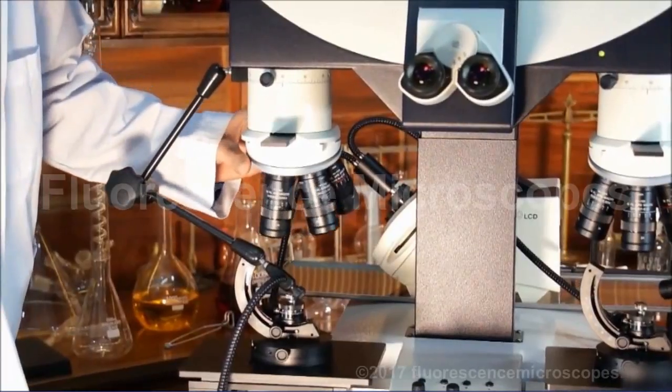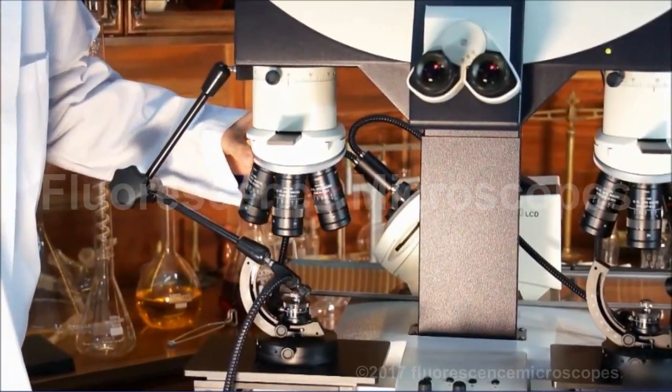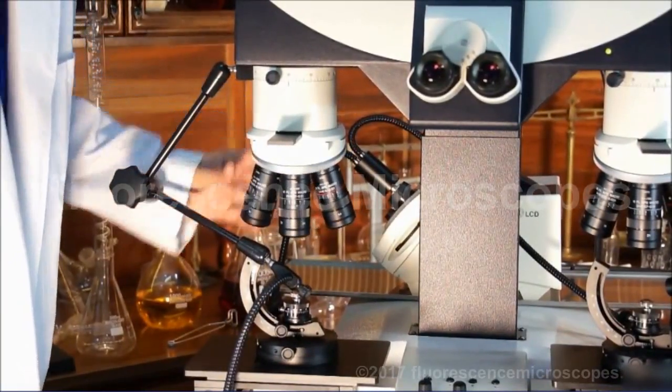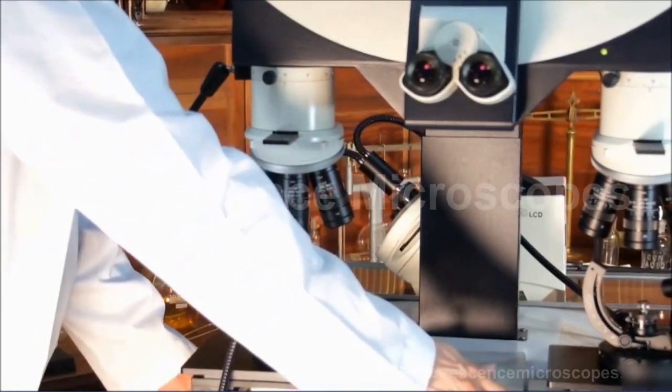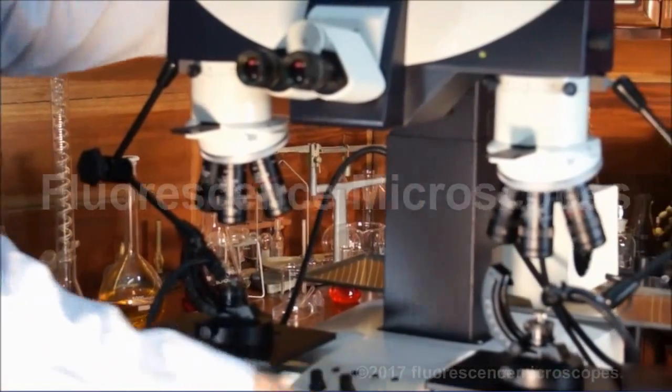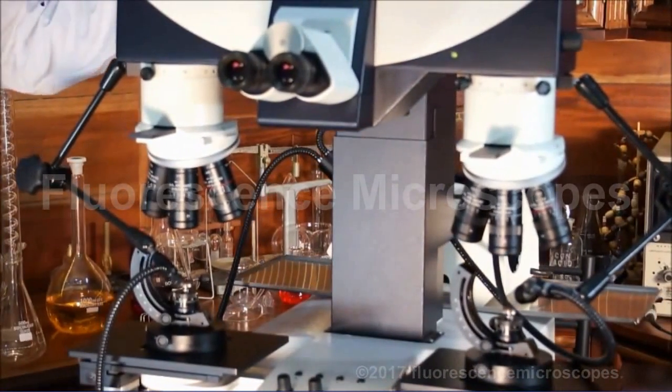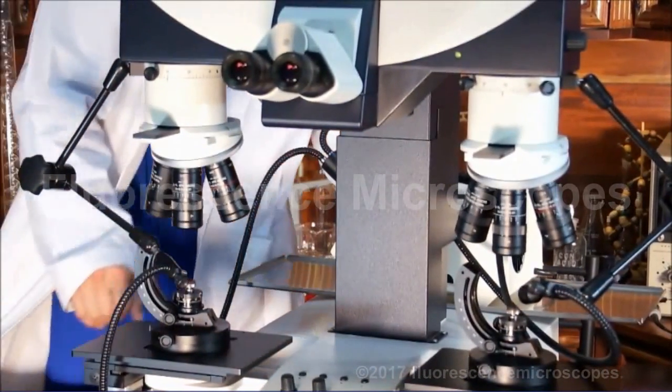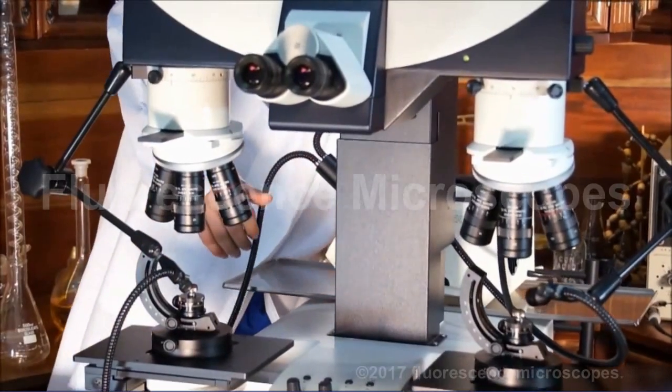You can rotate your objective lenses. Let's rotate the microscope around. I've got some cords at the back here.